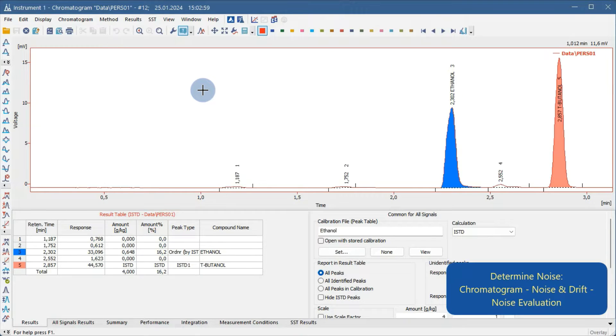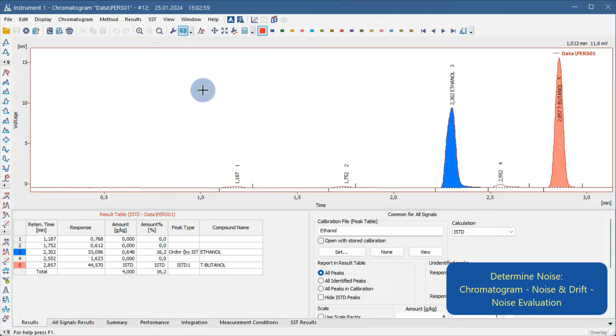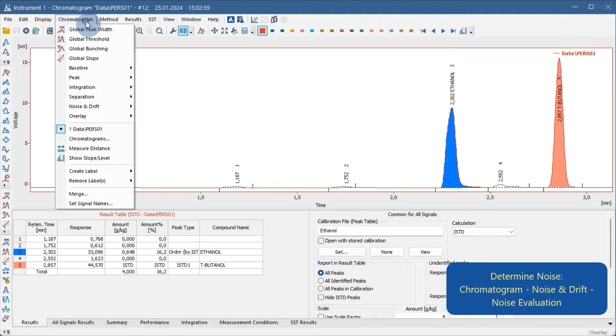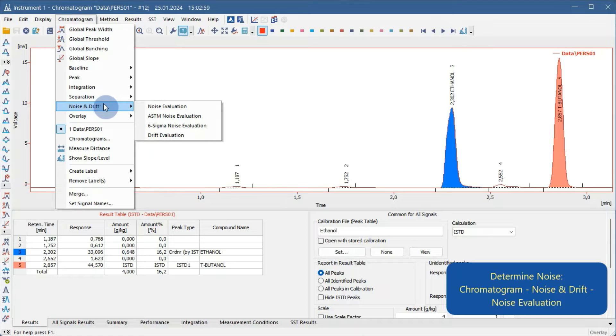Firstly, you need to determine the noise. Go to Chromatogram, Noise and Drift menu, and select Noise Evaluation.